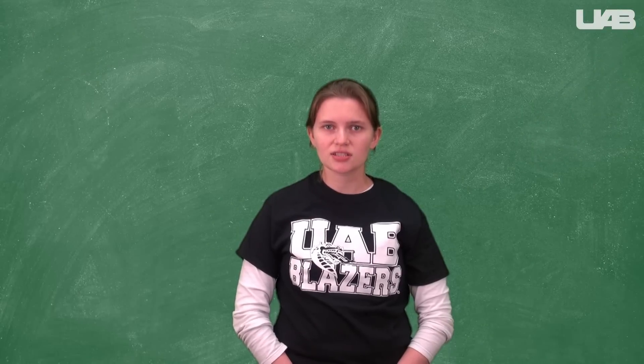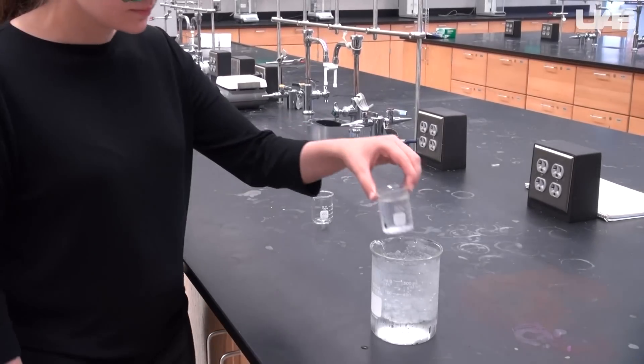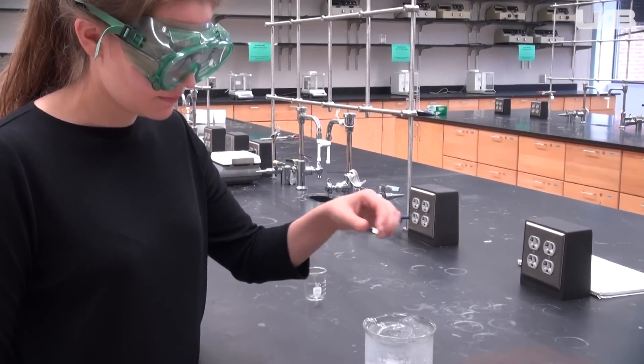Allow the reaction to proceed by letting the mixture stand for ten minutes. While it is doing that, you can prepare an ice bath and put a small beaker of distilled water in it.